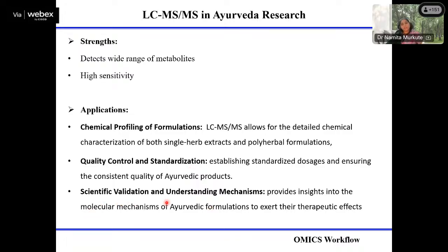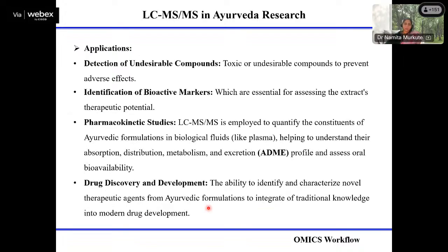Scientific validation and understanding mechanisms: it provides insights into the molecular mechanisms by which Ayurvedic formulations exert their therapeutic effects. Detection of undesirable compounds: if some toxic compounds are present in your sample, you can detect them using LCMS and avoid that particular formulation. Identification of bioactive markers, which are essential for assessing the extract's therapeutic potential, as there are some compounds in your formulation which are very active against some diseases.